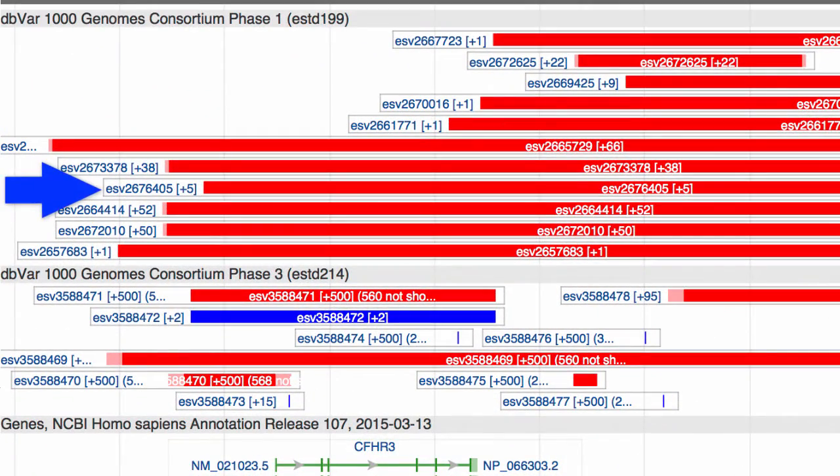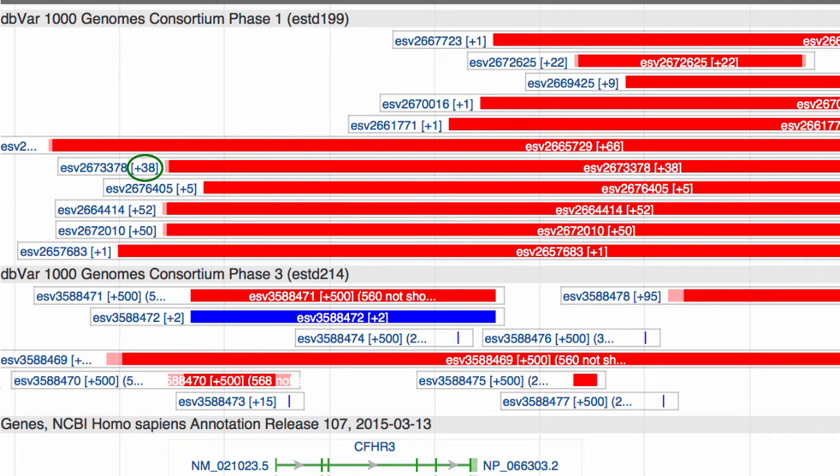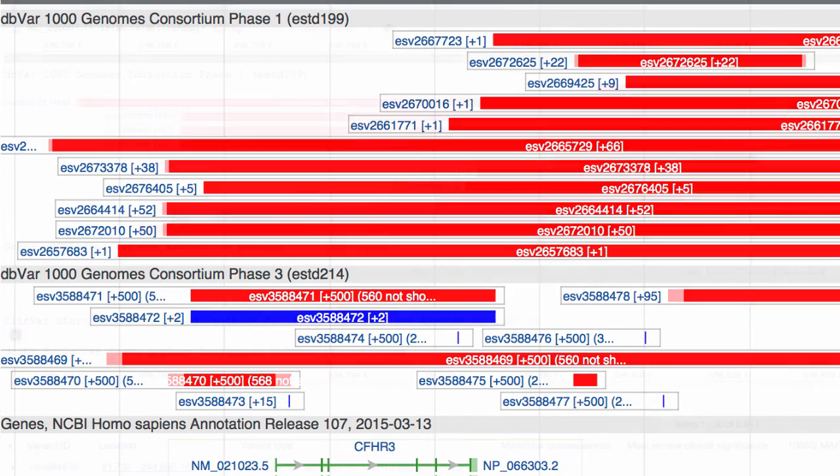Notice the plus 5 in square brackets. These numbers tell you how many supporting calls, or children, are associated with that variant.